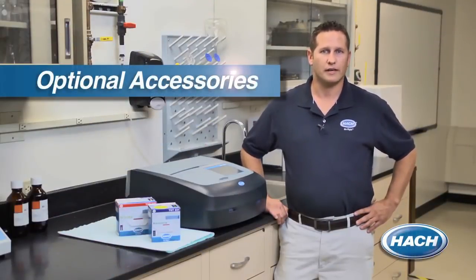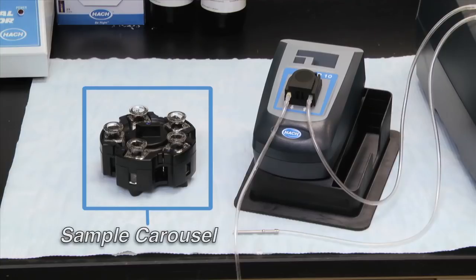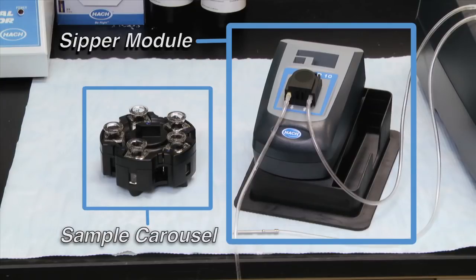By using one of Hach's sample carousels with the DR6000, you have the ability to perform a high volume of repeat samples. And if you need a defined, fast liquid flow that is air bubble-free for generating highly accurate results, a Hach sipper system can be used with this instrument to ensure optical errors are eliminated.